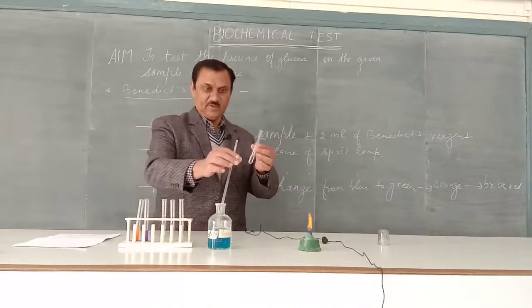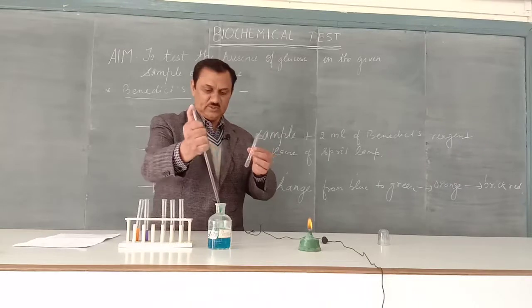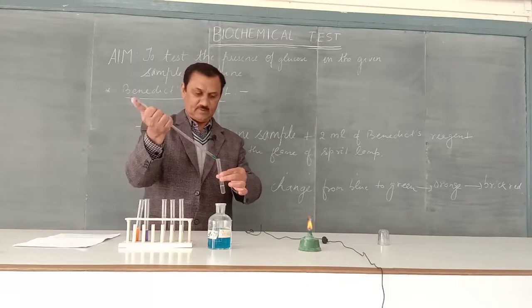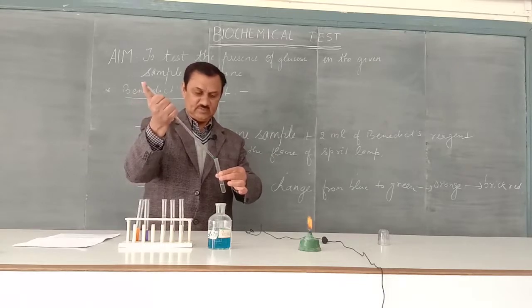To this sample, now add an equal amount of Benedict's reagent in the test tube.